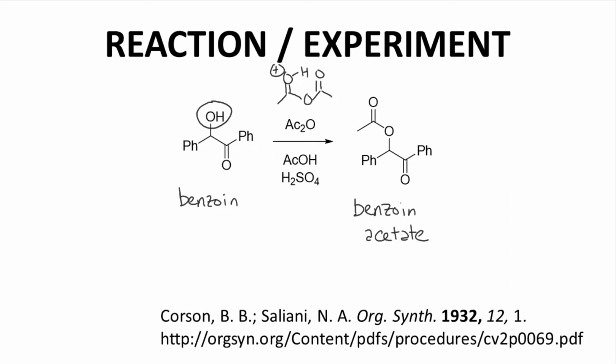This exact reaction is well known in the chemical literature. I'm approximately following the procedure described in the reference at the bottom of the slide. Great, let's do this reaction.